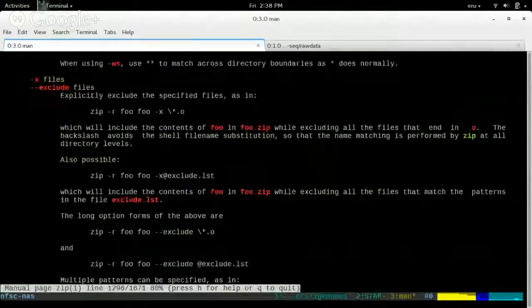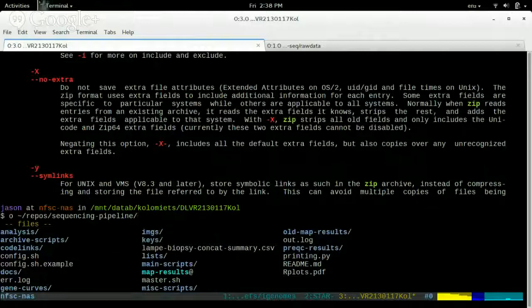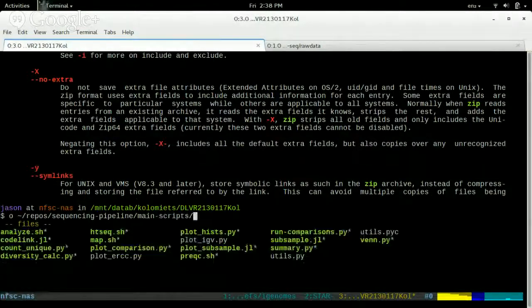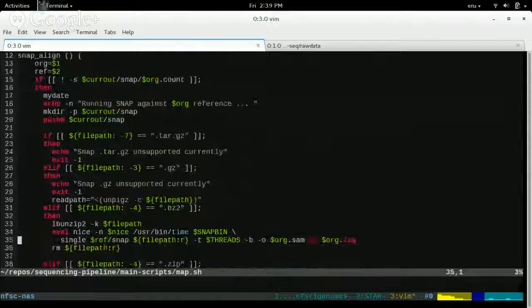And what was that zip? Let me just look. As part of our lab, we actually have a set of scripts that we use to do this sequencing pipeline, basically. I'm not covering them here because we haven't actually released them openly yet. But also, I think it's best to just start off your first times doing it by hand.